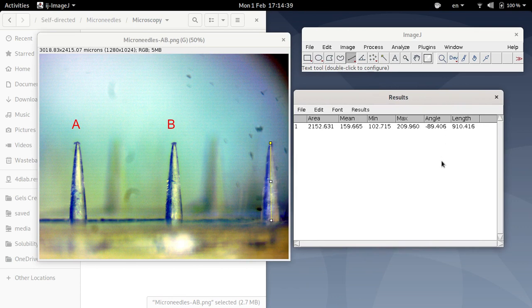Okay, so that's how you make measurements in ImageJ. But before you do that, you need to calibrate it. And I've shown you how to calibrate ImageJ as well.